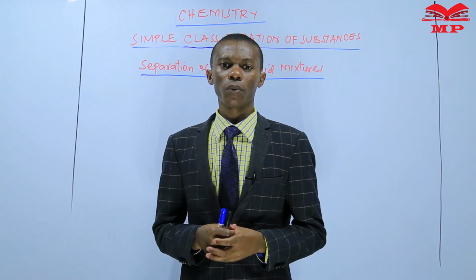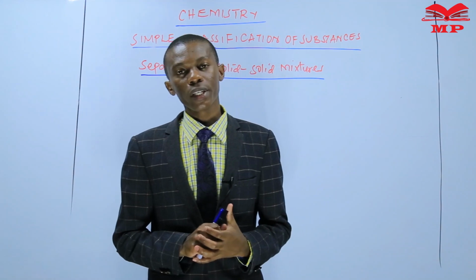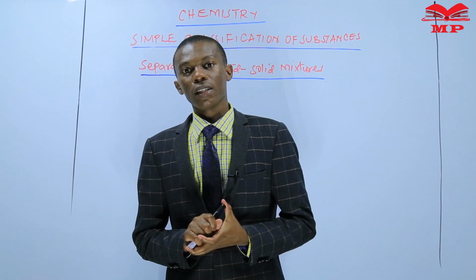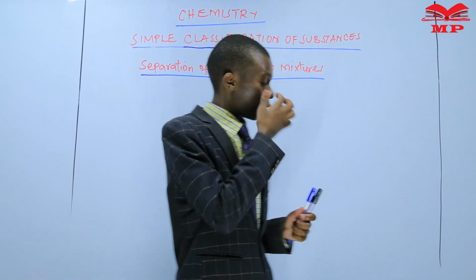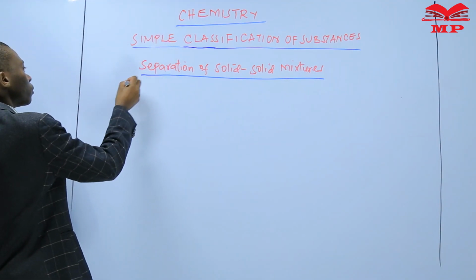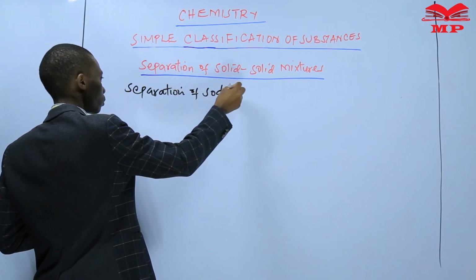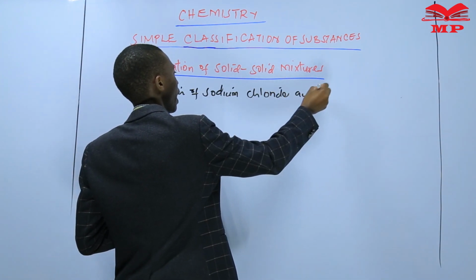In this lesson, we are going to discuss separation of another solid mixture. In this case, it will be separation of sodium chloride and iodine.